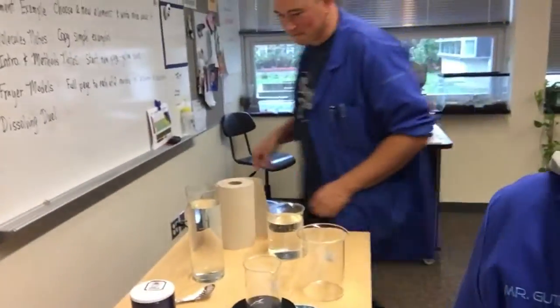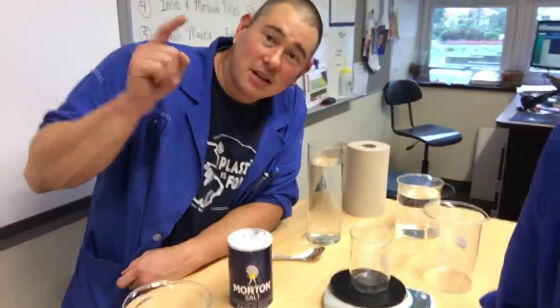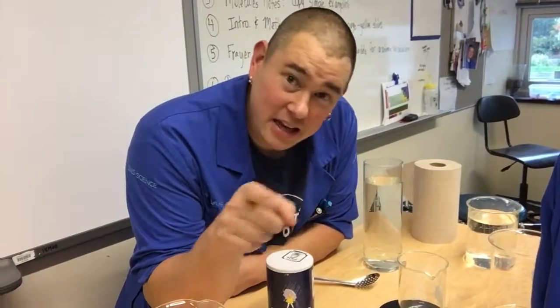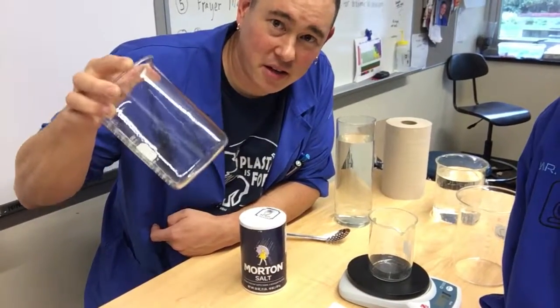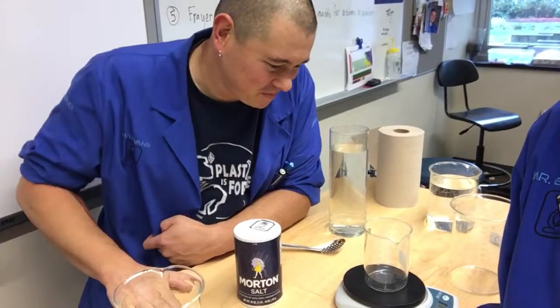So what we're going to do, we are going to take a look at a particular sample. We're gonna look at the dissolving lab that we did this afternoon, and for your catalyst today, you're going to look at the sample that we make in the big jar and see if it's any different from what you saw in the demonstration that Mr. G and I did in class.